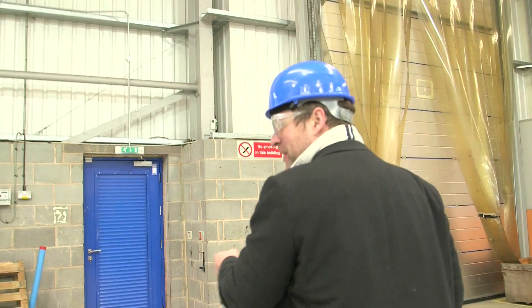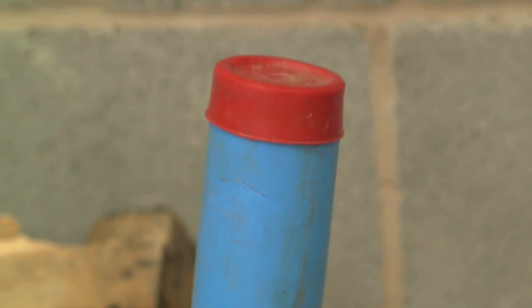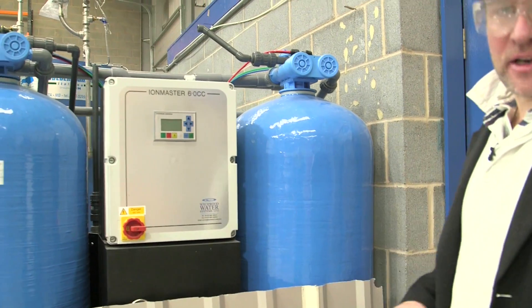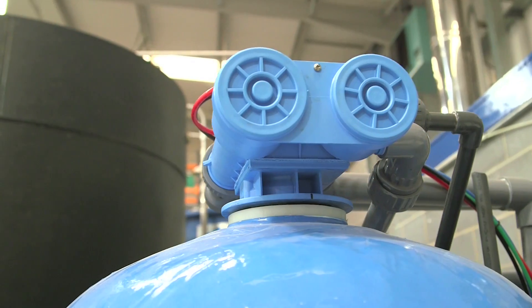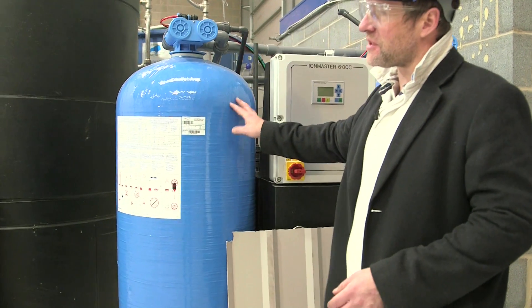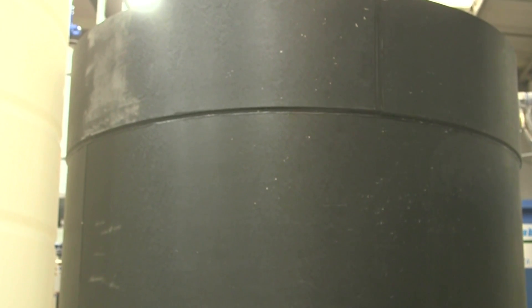We'll start at this end - this pipe here. This is a water pipe; it's going to take our water flow into the building and then we have to process it. We de-ionise it - we have to take out all the various components that are in normal water that we don't mind drinking, otherwise, like a furry kettle, we'll end up with a big problem inside the pipework. We take all those bits out of the water and put them in a holding tank, so that's some very, very clean water. It'll be drinkable, but it might taste a bit weird.